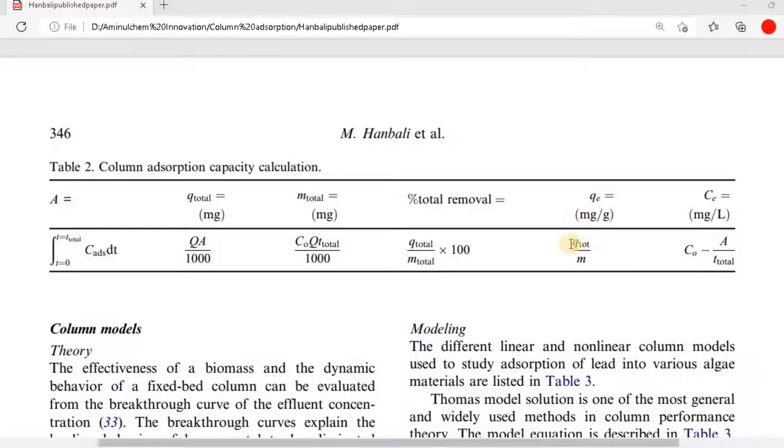And QE equal to Qt divided by M, and CE equal to C0 minus A divided by T total.